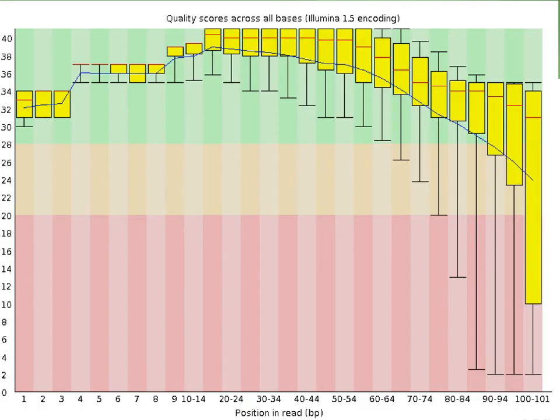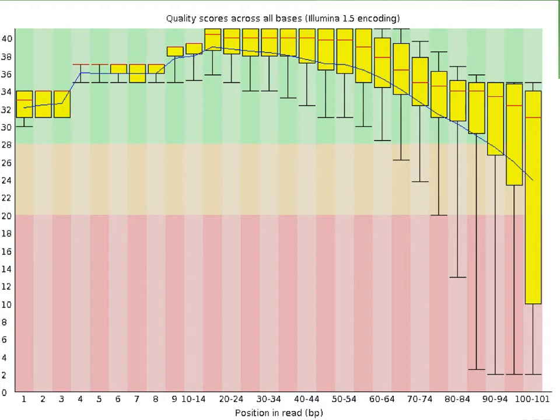This is the first plot of interest. It represents the quality score distribution across all bases. Remember that Illumina uses a sequencing-by-synthesis approach and that every read has the same length. The x-axis represents the position in the read. Note that the first 9 bases are individual, whereas the rest is binned into groups of 5 bases. The read length in that example is 101 base pairs, so the last bin only represents 2 bases.